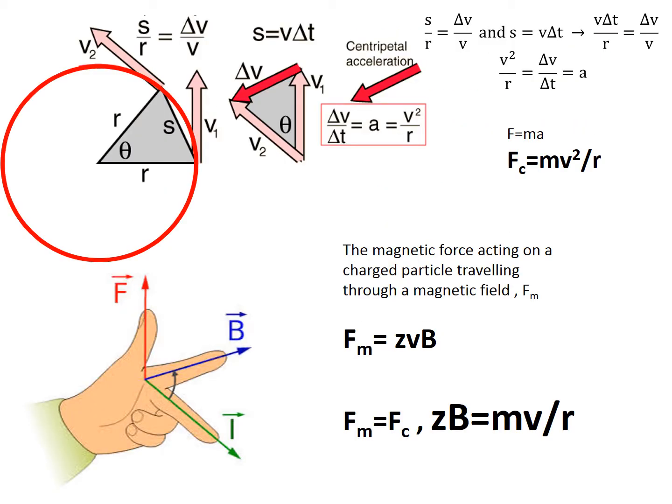Okay, so the details of this are not really that relevant, but imagine this is the force that is accelerating our ions to bend. This is basically the centripetal acceleration that's causing our ions to bend. If we had a magnetic field going down through here, our ions would go like that, but they get bent around by the magnetic field. Okay, and that can be described thus.